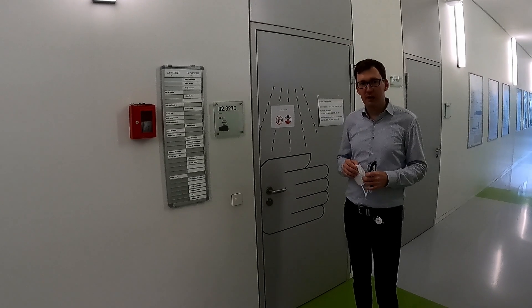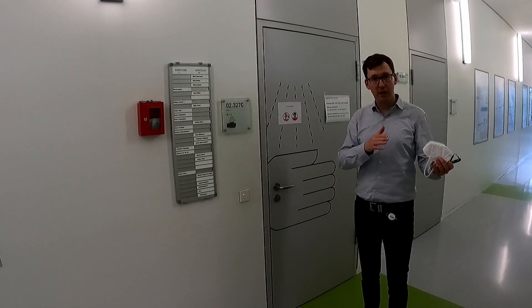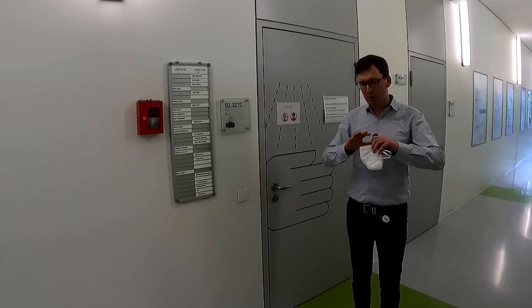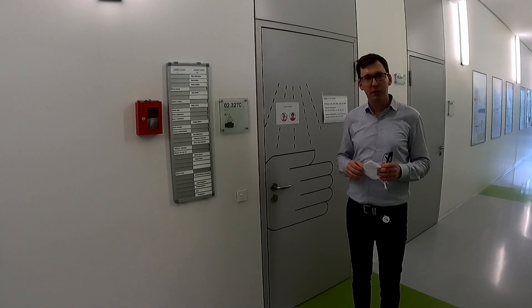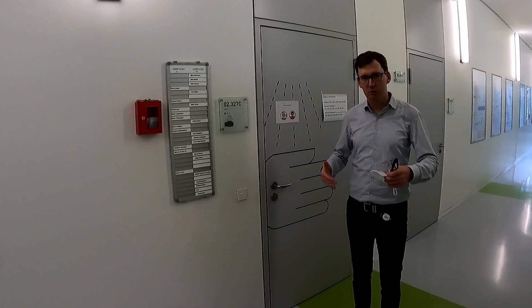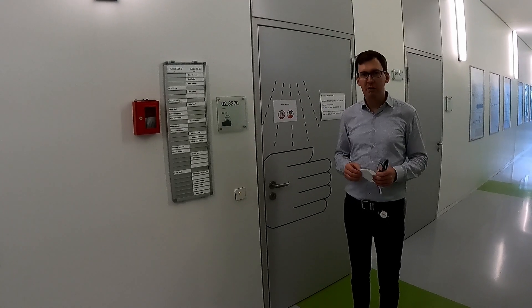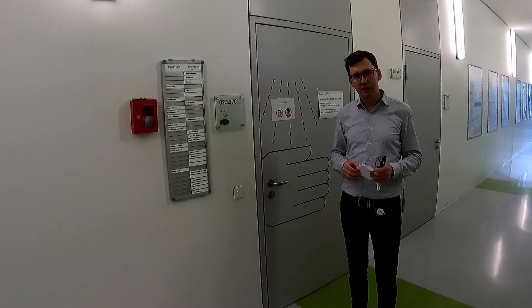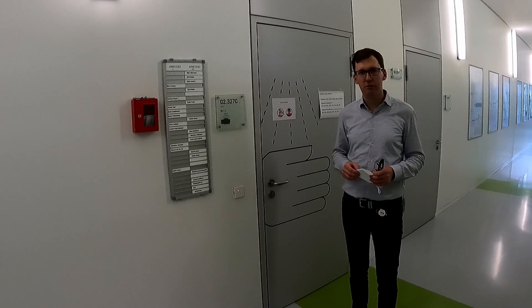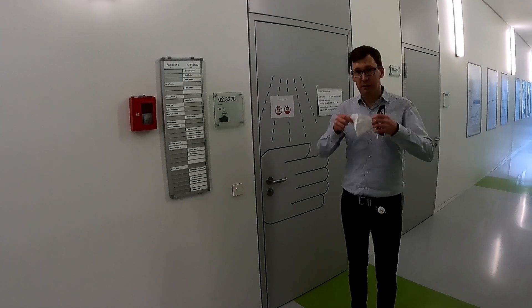Welcome to our main lab, which is divided into two areas: the gray area and the white area. The white area has completely metal-free conditions — you can only enter with a special lab coat, over-shoes, and similar precautions. The gray area is not as strict but still requires changing shoes and wearing a special lab coat.